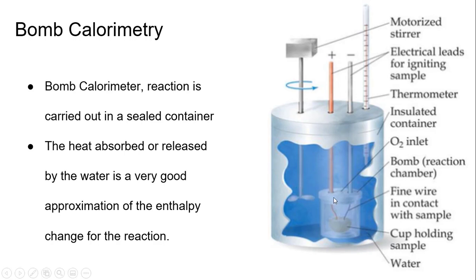with water. It's completely dry, and because this is combustion, the heat energy is going to go out into the water. We will detect what the changes are through the thermometer, and this is going to stay completely dry. So in a sense, this is insulated. Our sample is insulated from the water, but the whole thing is insulated from the surroundings outside of that.